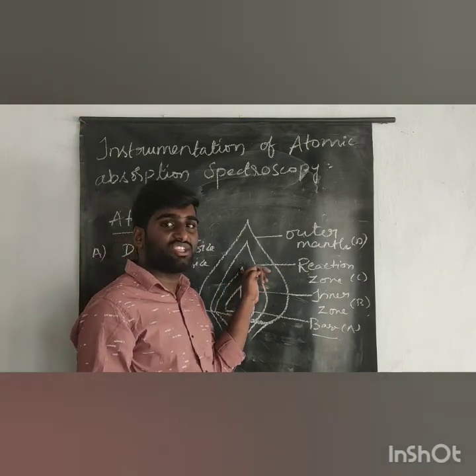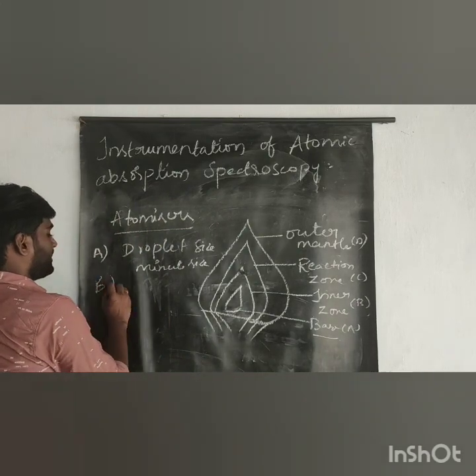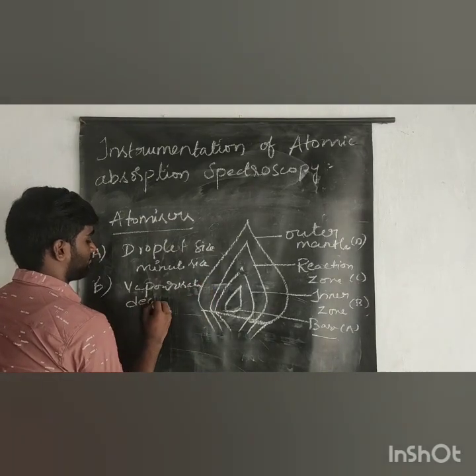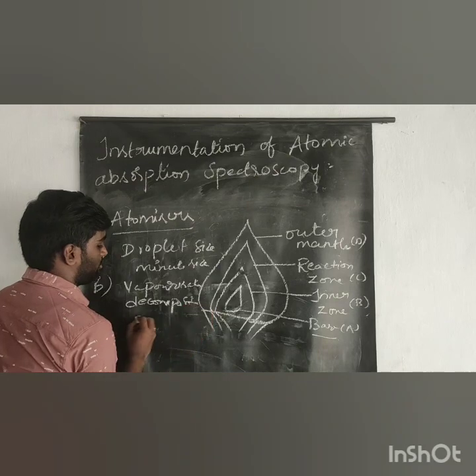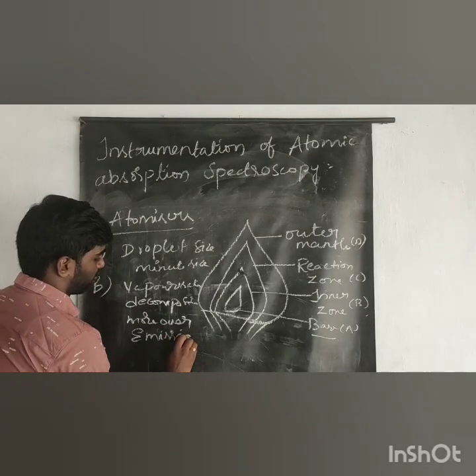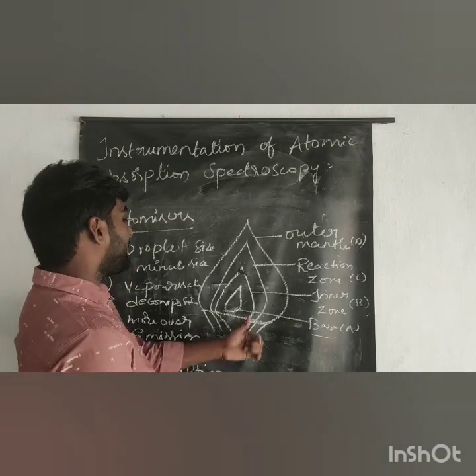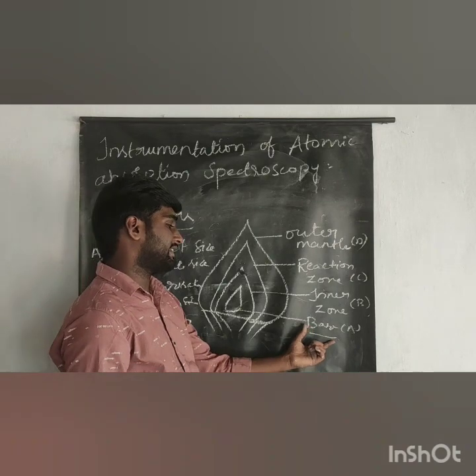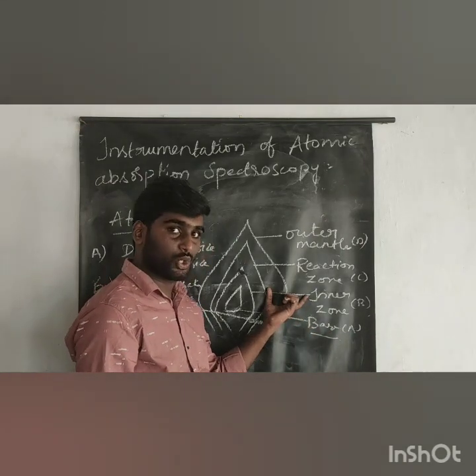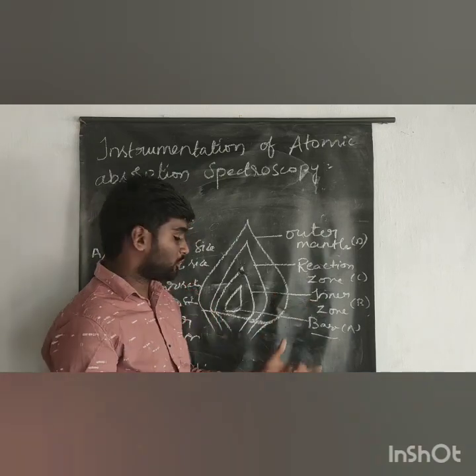Here in the inner zone takes place the vaporization or decomposition, moreover emission or absorption starts. While the sample is entering the base, it is in droplet or minute size; after entering the inner zone, vaporization or decomposition takes place.